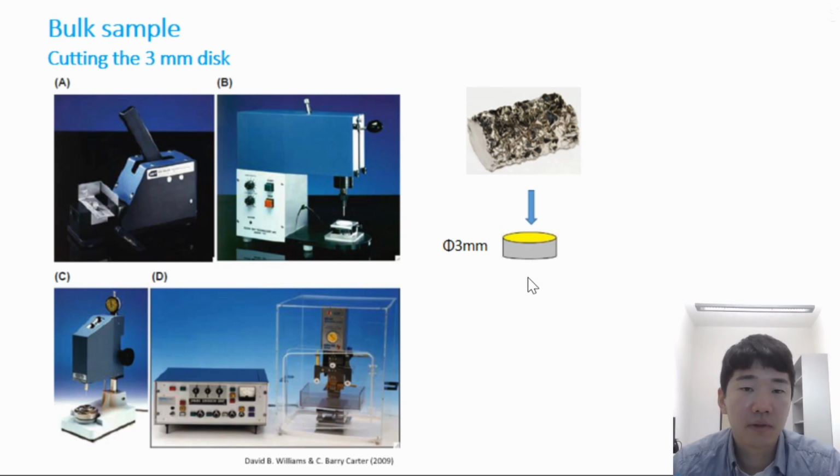In this step, you need to think about possible mechanical damage. If the material is reasonably ductile, then the mechanical damage is not so crucial. But during punching, the shock can induce shear transformation in some materials, especially brittle materials. In this case, spark erosion, ultrasonic drilling, or using a grinding drill will possibly be better options than punching.